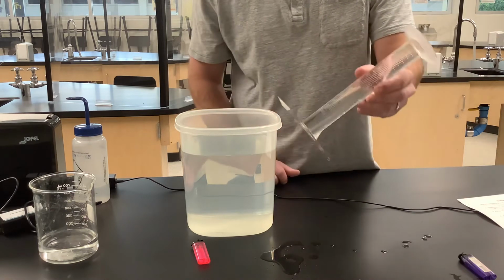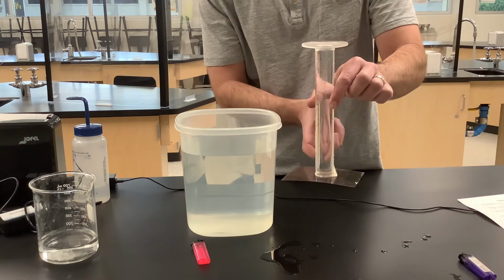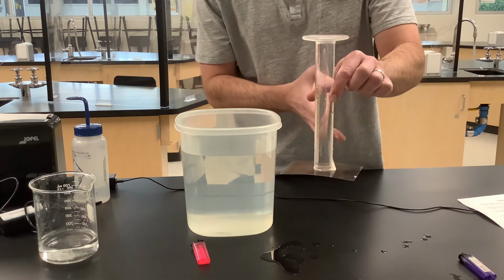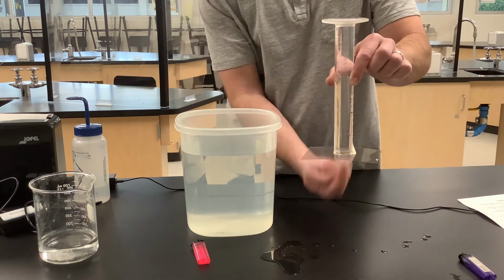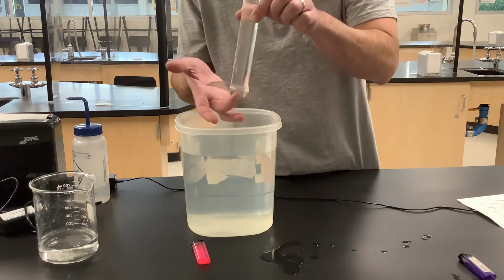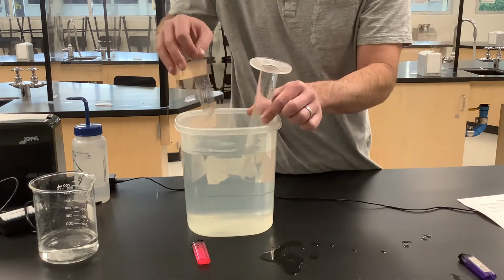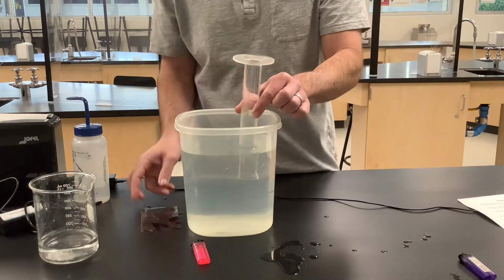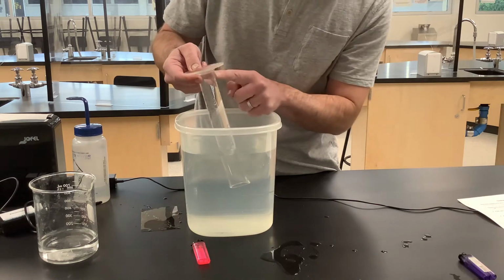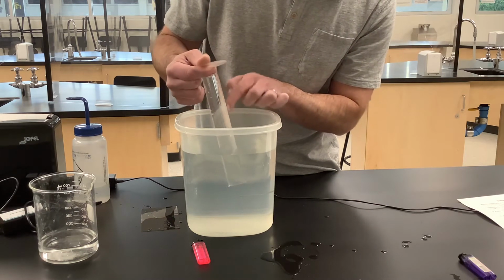So we can flip this thing upside down, and the mass of water that we have here is not large enough to overcome the pressure of the atmosphere pushing up against the card. Now I'm going to submerge just the tip in there, and I can pull this out. You'll notice that the water has stayed inside of the cylinder quite nicely, so there's no air in there.